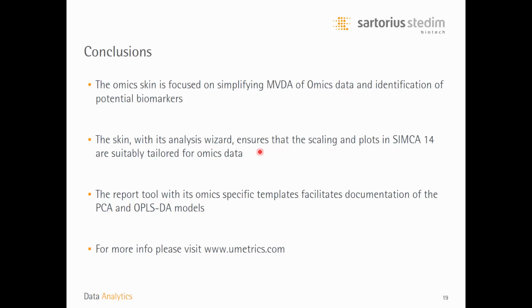And the skin with its core component, the analysis wizard, ensures that the scaling and plots in the SIMCA software are suitably tailored for omics data. As we've also seen, we have this report tool with its omics-specific templates that will facilitate documentation and, not to forget, communication of the results coming out of the PCA and OPLS-DA models.